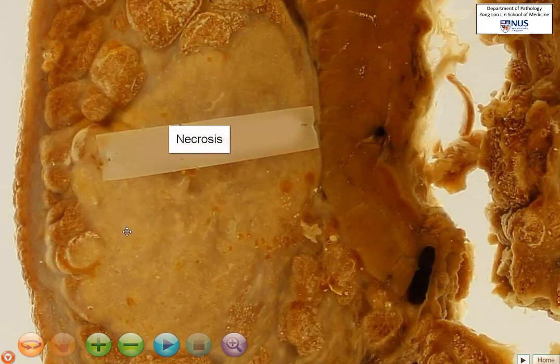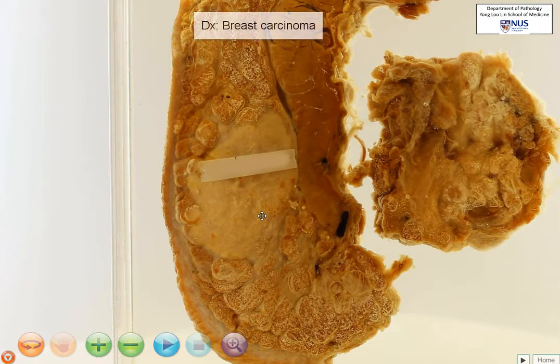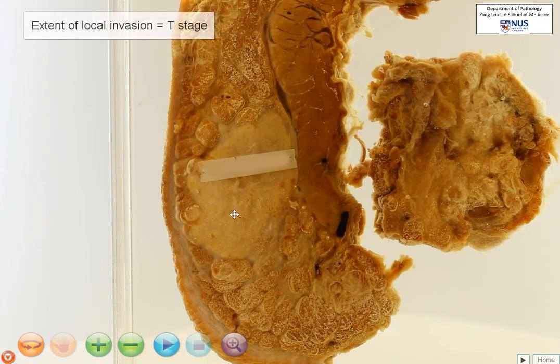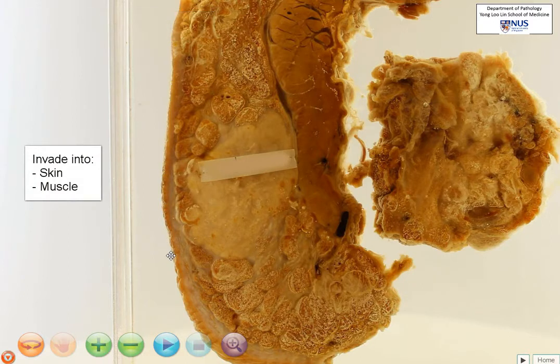There is another area here. So this is a breast malignancy, and of course the most likely malignancy in the breast is a breast carcinoma. Now we know that these are invasive tumors, and therefore we need to assess the extent of local invasion, and we want to look at structures it can invade to, which is anteriorly into the skin.